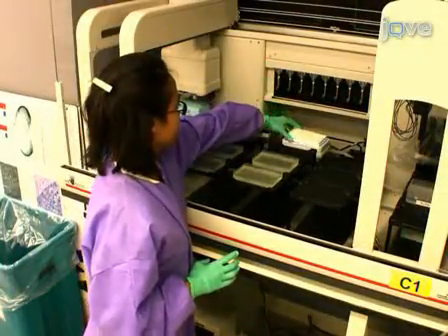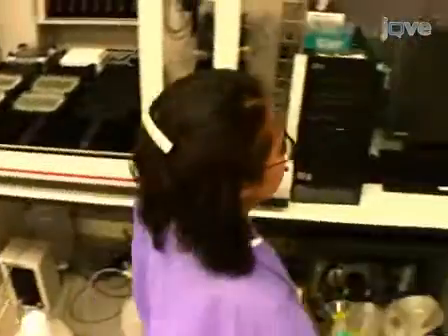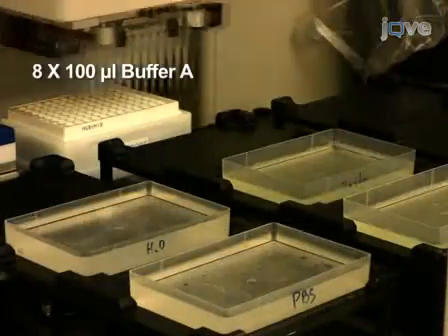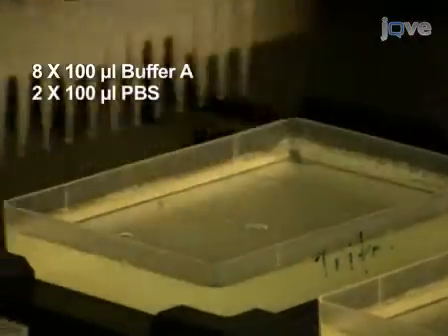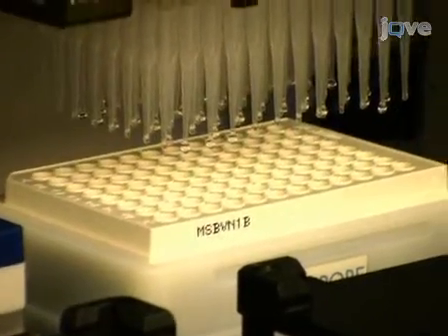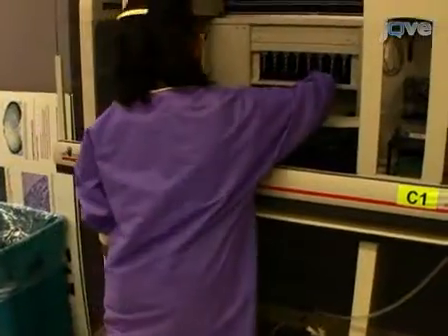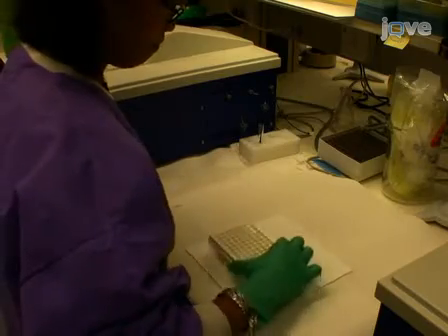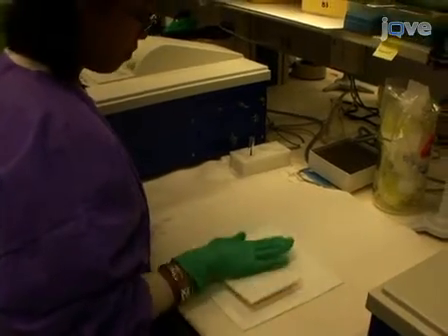Next, wash the filter plate using a Biomek FX automation workstation with a vacuum manifold. Each well is washed 8 times with 100 µL of buffer A, followed by 2 times with 100 µL of PBS. Following the last wash, the vacuum is turned off. Remove the filter plate and blot it dry using a stack of paper towels or filter paper, making sure to remove moisture on the top and bottom of the plate.